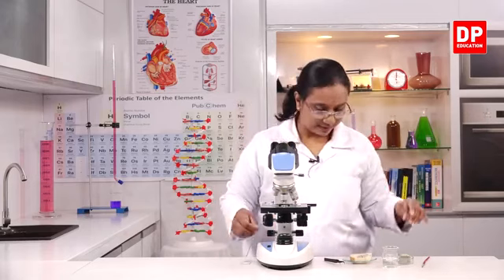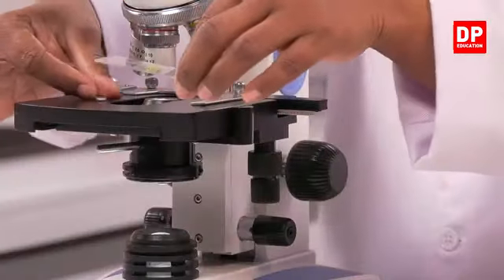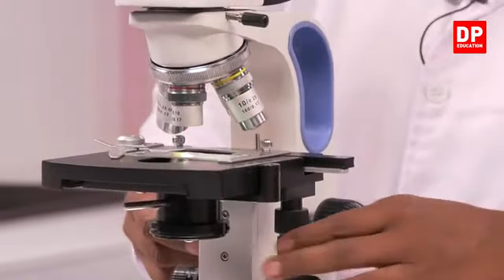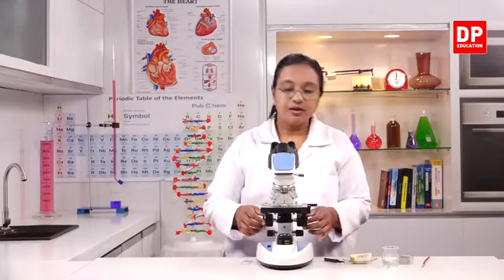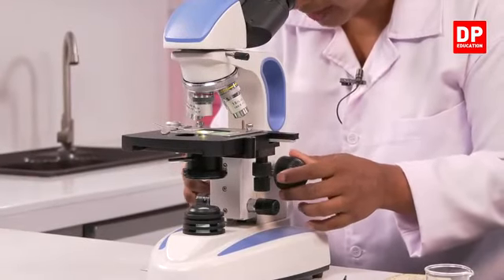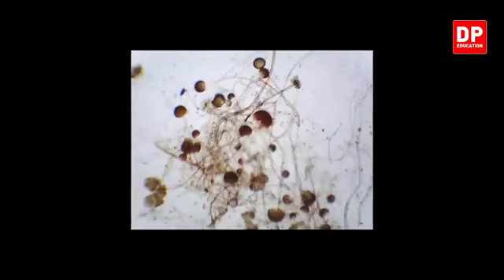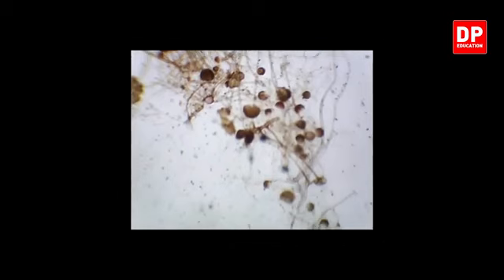So I'll remove whatever slide we have. We have to put it to low power, and here I make sure that the sample is in place with the light source. So now if we observe it through low power, can you all see the growth of fungus there? You can see that particular type of microorganism grown on bread. Can you all identify the shape of it?